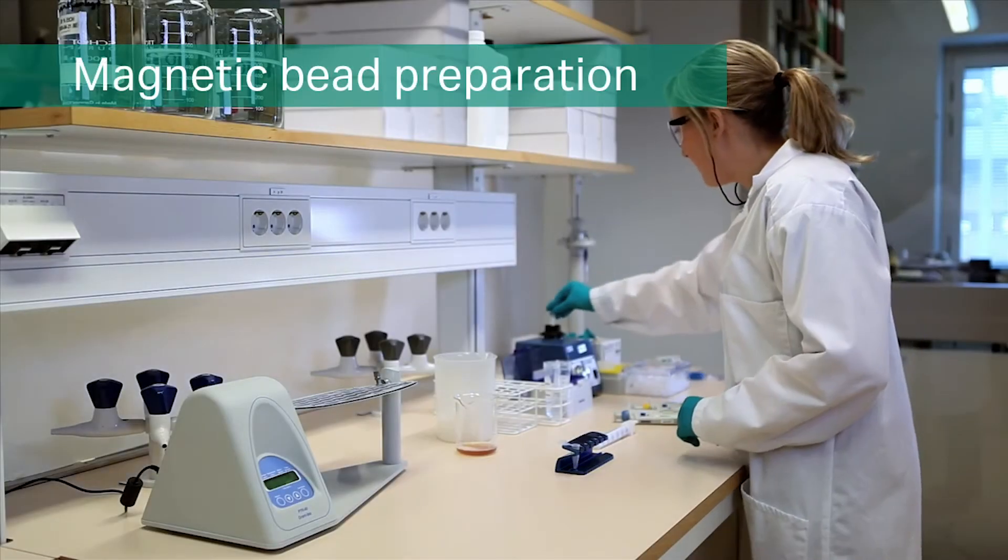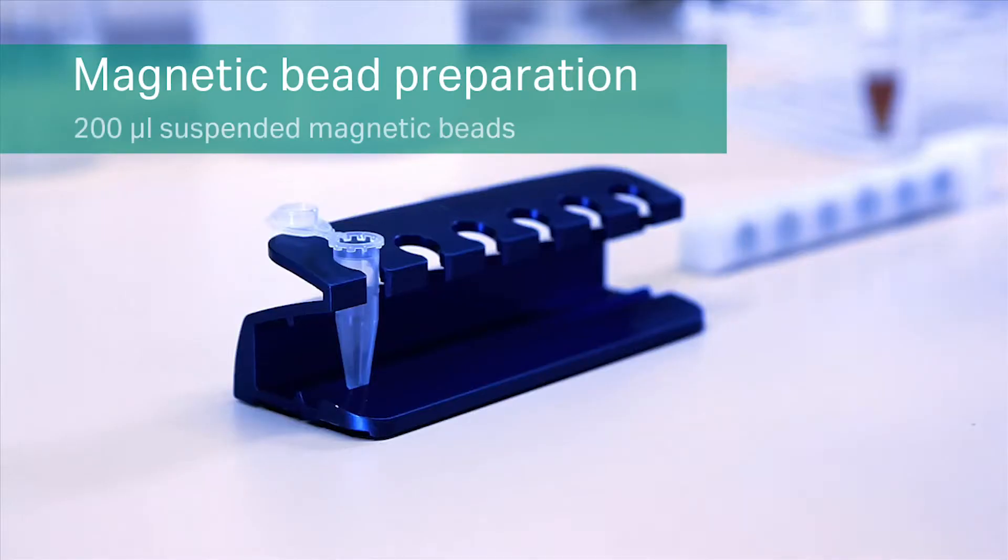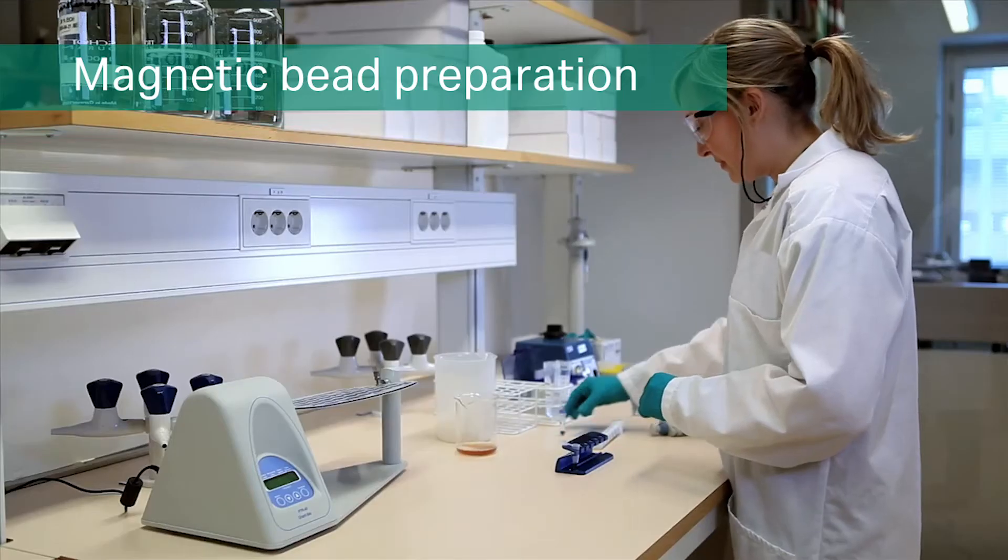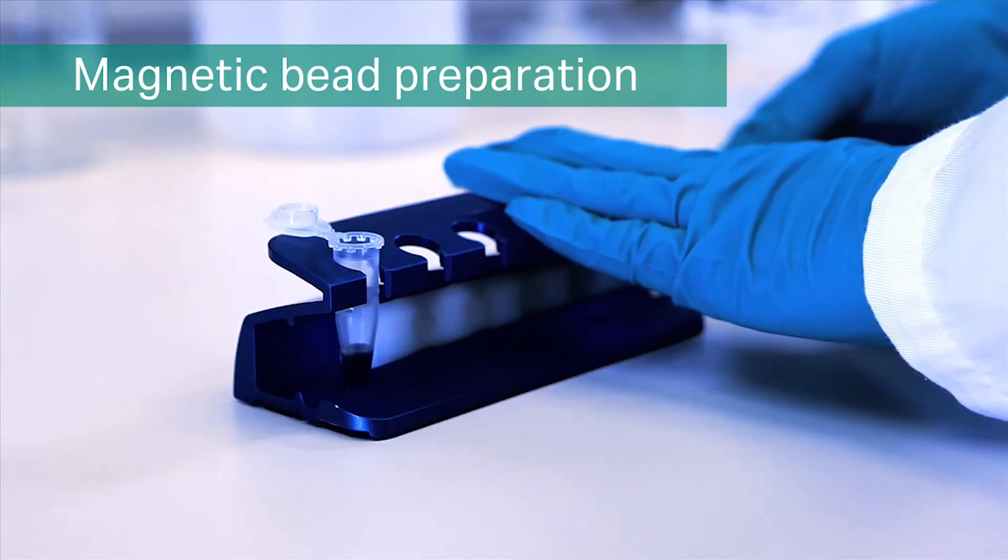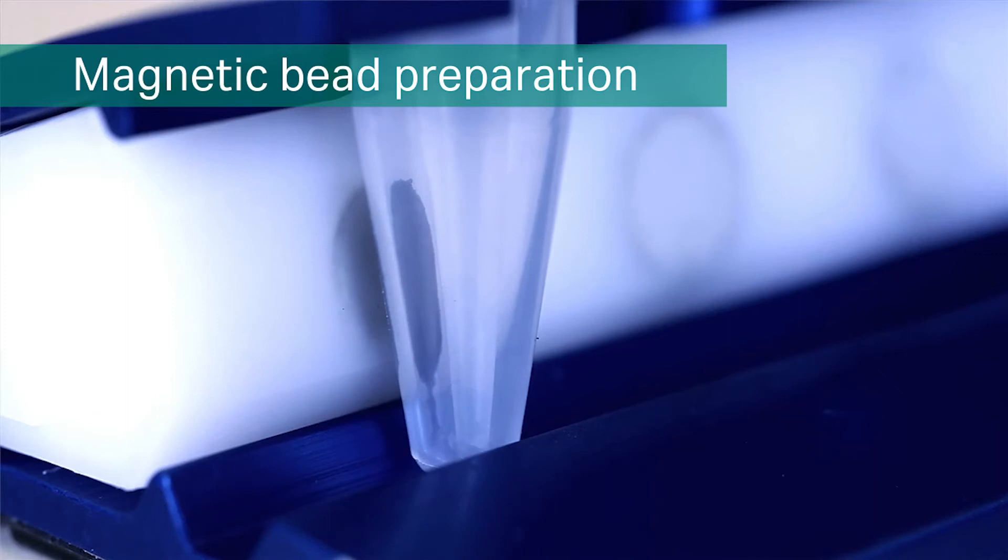Start by mixing the medium slurry thoroughly by vortexing. Dispense 200 microliters of suspended magnetic beads into an Eppendorf tube and place it in the magnetic rack. Insert the magnet in the magnetic rack before removing the storage solution.